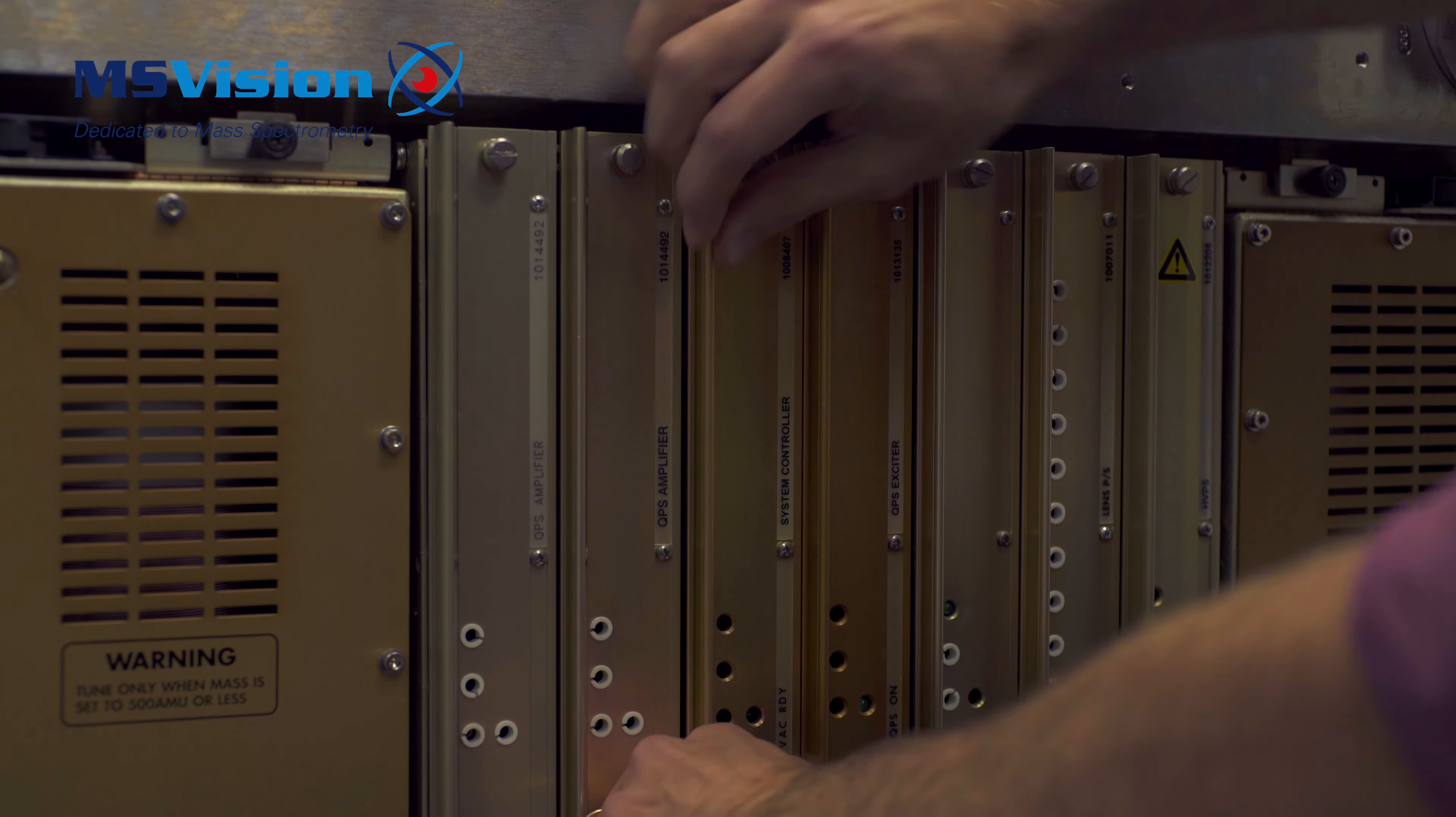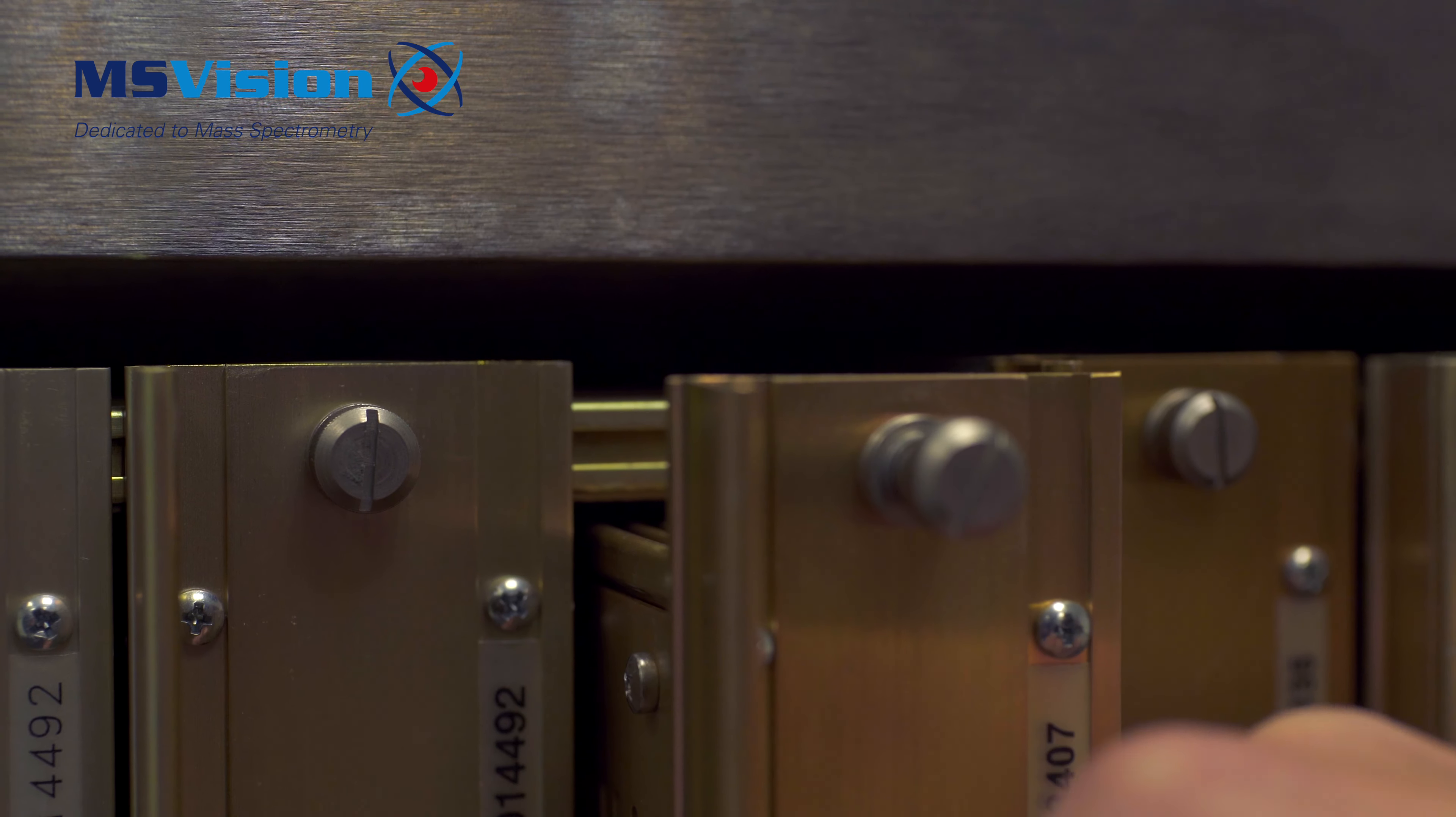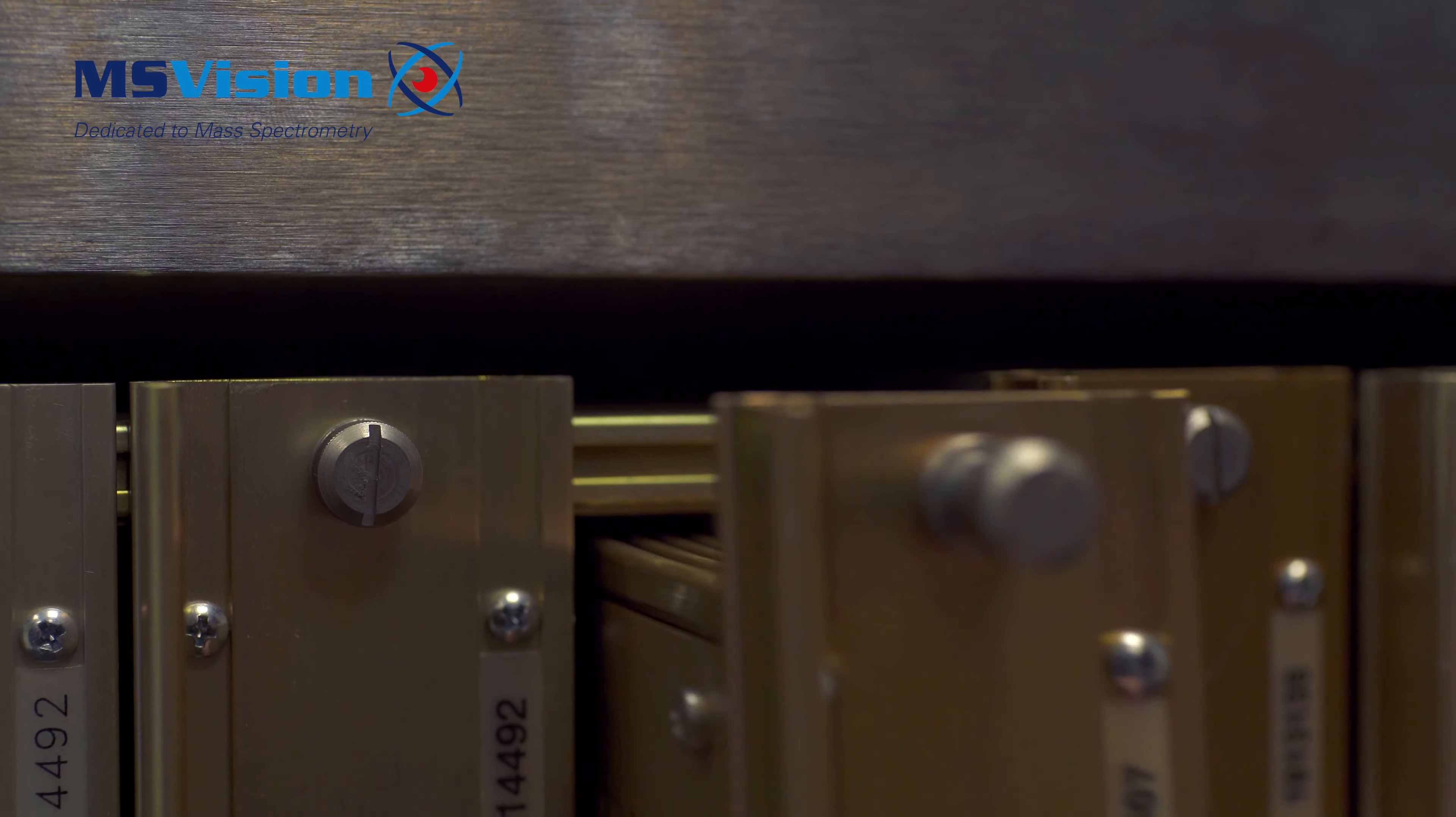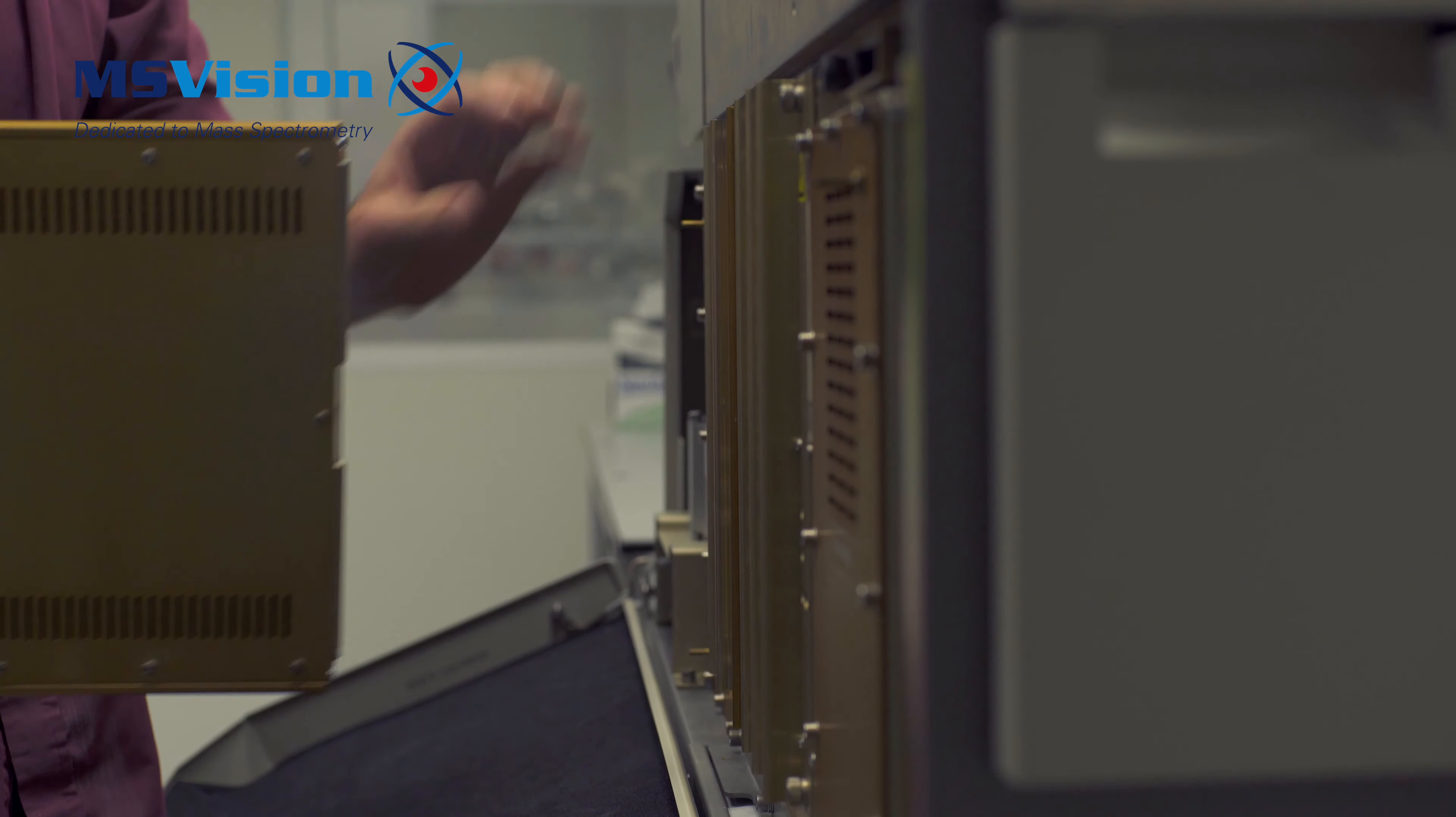Loosen the two screws holding the board in place. Firmly pull and then slide the board out all the way.